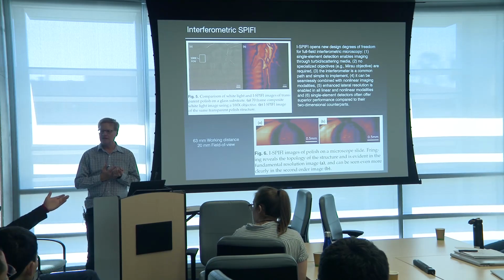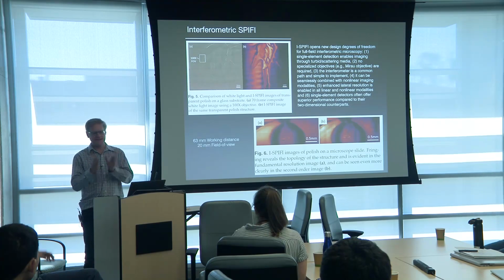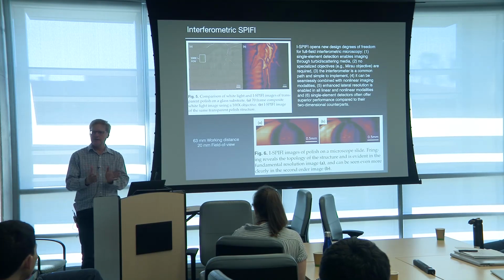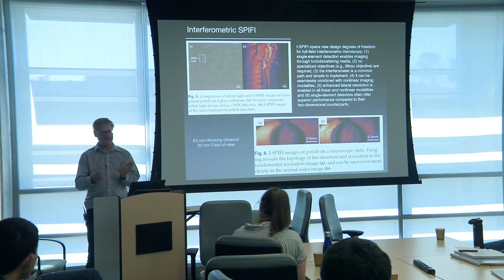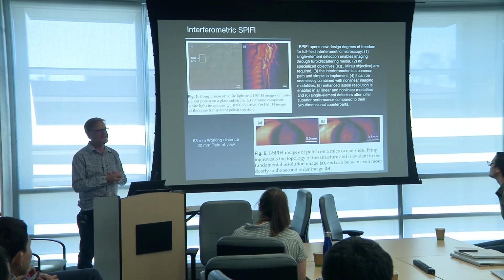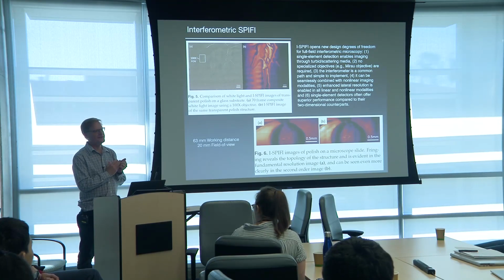And you have the speed, so you'd be able to see propagation. I've seen people take fixed slices, put them in an interferometer and image that. Here we have the opportunity to do a similar thing if it was of interest. It's not of interest to me, but someone else might.